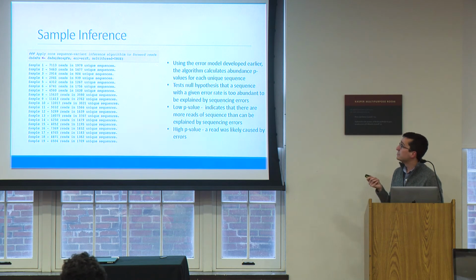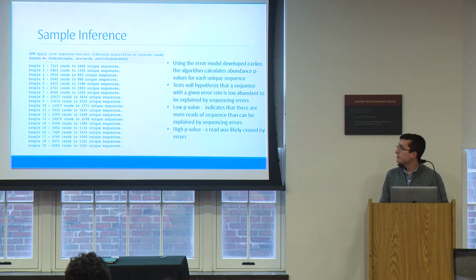So DADA2 does that on all of your samples. It does the same thing on the reverse reads. Nothing really special about that.